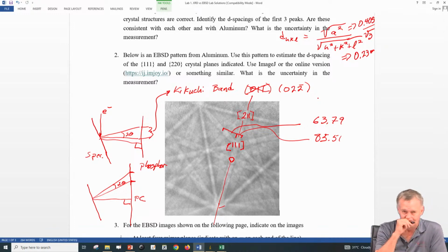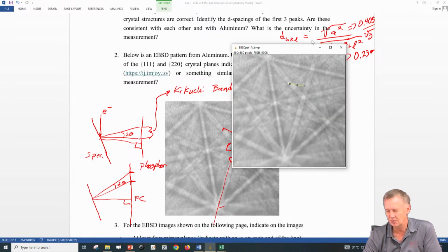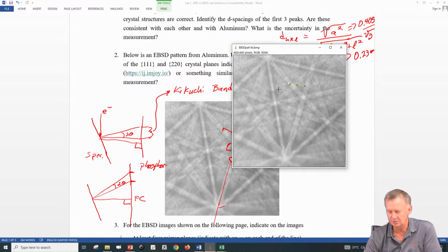Now, how do you know pattern center is there? We calibrate it. Yeah, we calibrate it in there. Okay, so we have the pattern center. Now on this image I showed where the pattern center was. Right, on this one we've been playing with, the pattern center is this white dot here. On this one, we just know it's up in that range somewhere, just above this.